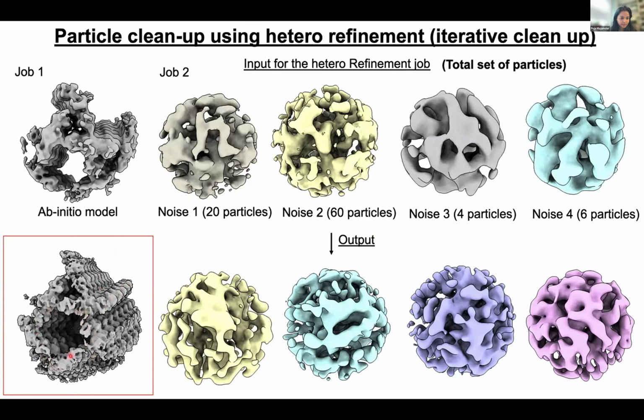And as a follow-up, do you expect that to be different in the cryo-ET in the future, or is this it? So we are interested in cryo-ET to understand how these filaments assemble. We are seeing single filaments, and then these single filaments are interconnecting with each other, forming a network of a spread.